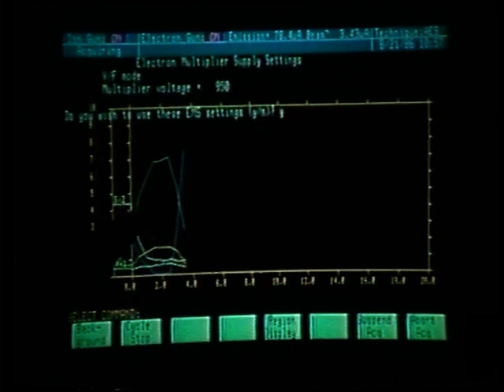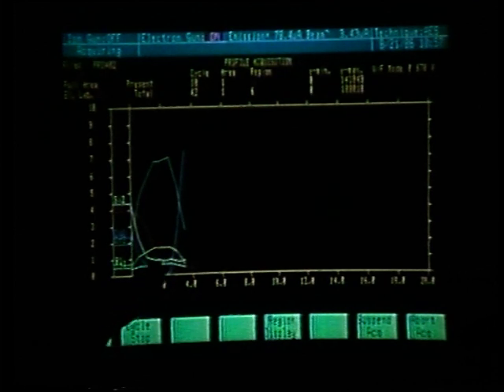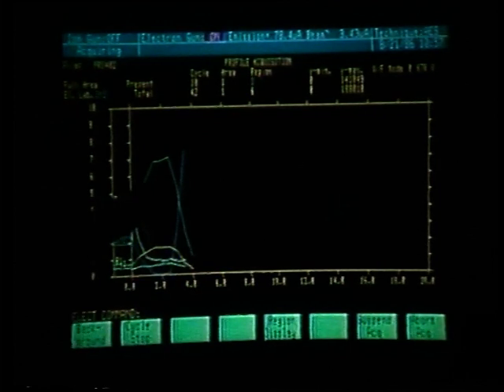We have now returned to the profile. The first thing that happens is it will sputter. In a cycle, we sputter first, then we acquire the data. At this point, it is sputtering, and now we begin data acquisition. Notice that we continue from where we suspended. We have a continuous and an uninterrupted profile. As I mentioned, if we would have said no to the EMS routine, the multiplier would have been set differently, and we could have had a discontinuous looking profile.